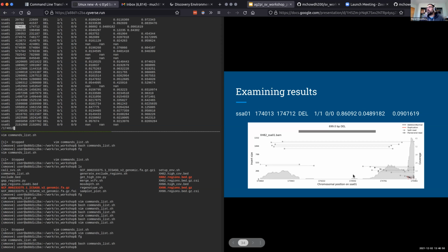So it seems like there's just poor alignment quality in this area, and that low coverage seemed to have confounded the SV caller, whereas the model itself has been trained on images that look like this and has been told explicitly that images that look like this are essentially false positives. Essentially using the same types of intuition that we would use when we're visually validating this. To me, this looks like a false positive. And so as a result, by me providing the type of training data that said that this was a false positive, the model will also make that type of prediction.